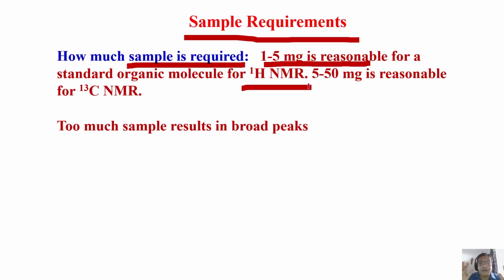If you want carbon-13 NMR, a little higher sample quantity is required, because the sensitivity of detection of carbon is much less compared to that of proton.